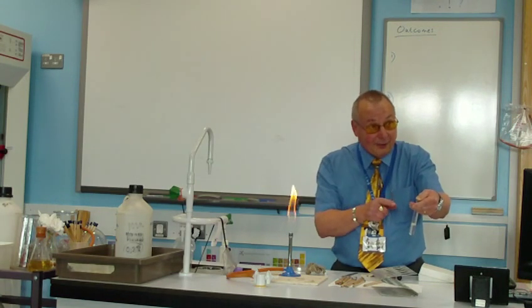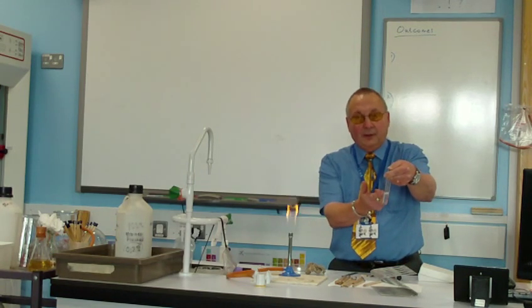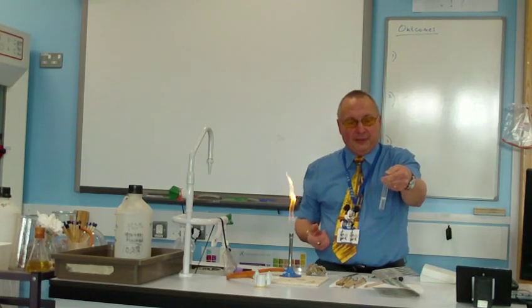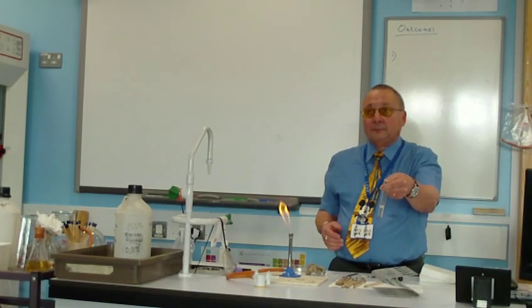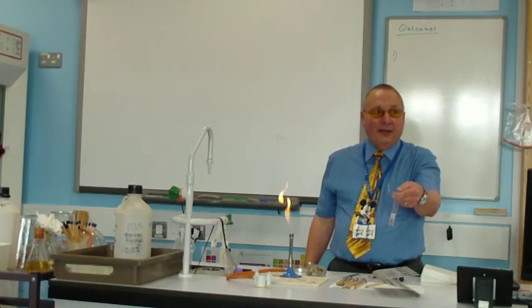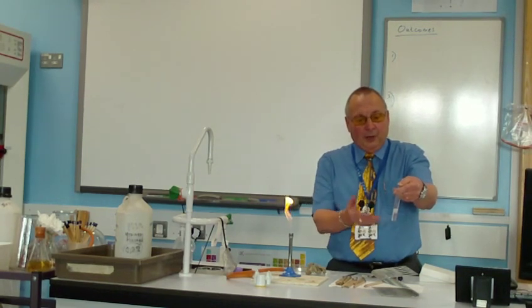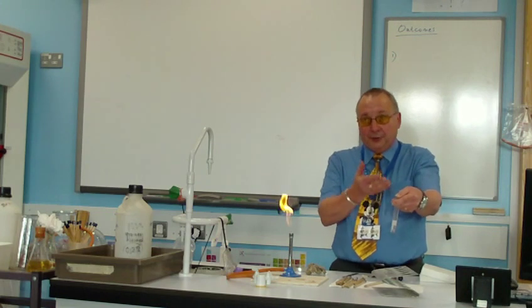Bubbles. Come on, you've told me twice already. It's producing hydrogen. And hydrogen gas will come up here, won't it, and mix with the air that's already there. What's going to happen to the pressure in that tube as this gas is being produced? Is it getting bigger or less? Bigger. So in fact, after a while I can start to feel it starting to push my thumb up.